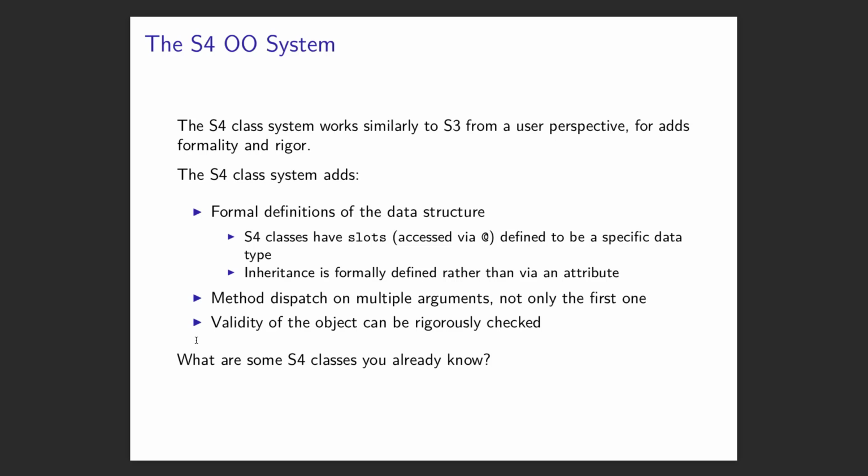MSstats, the package, I'm not sure if it has any S4 classes in it, but MSstats itself is a package, and Sunghang, does it have any S4 classes in it? No. MSstats primarily works on existing data sets, so it doesn't really define its own classes. It just works on data that you give to it. So some packages won't create their own S4 classes. They'll just use classes that other packages have defined. Vincent named a few the other day. Anyone remember what those were?